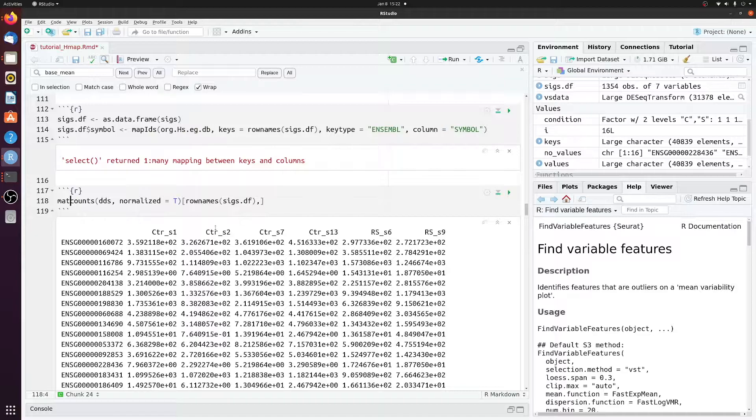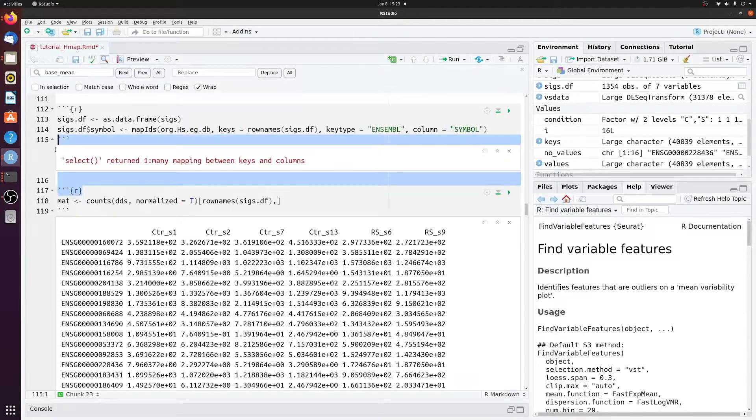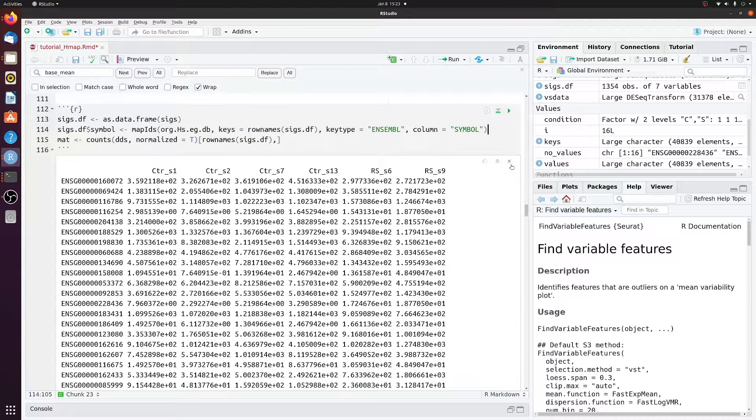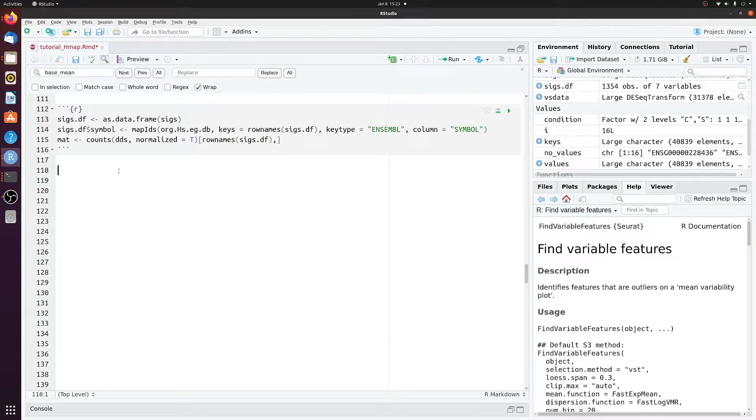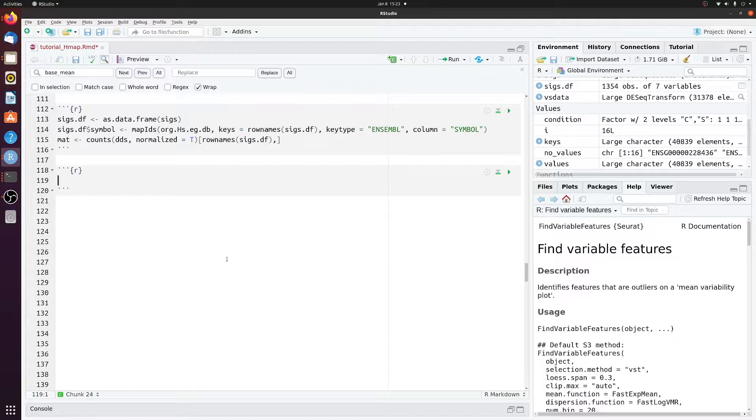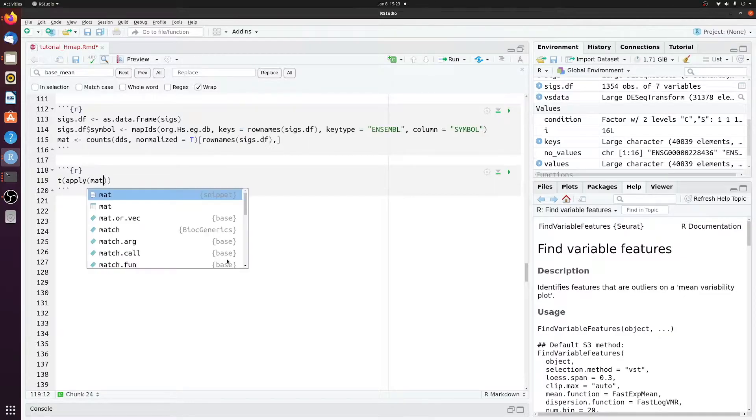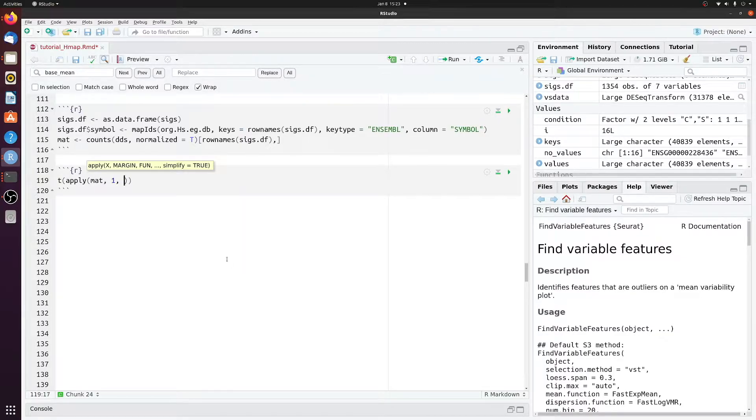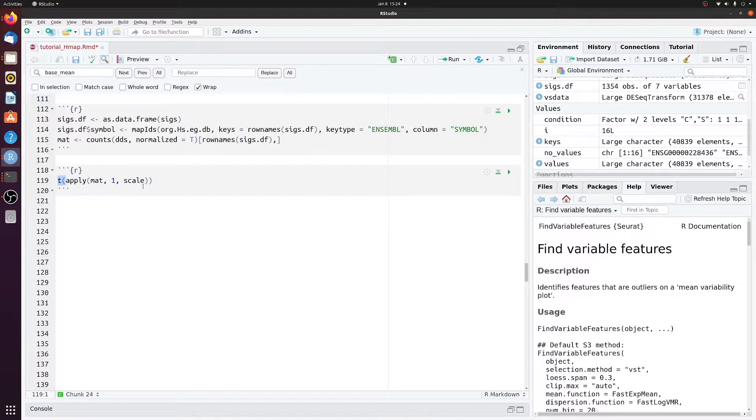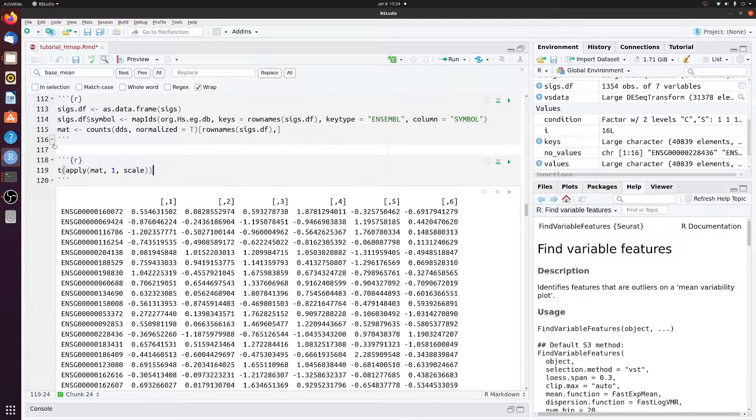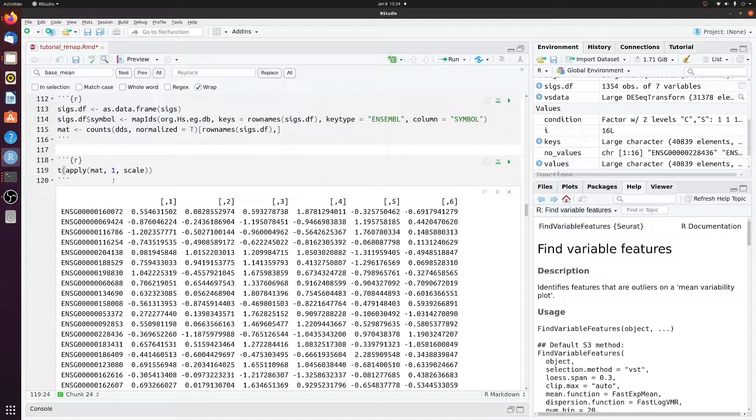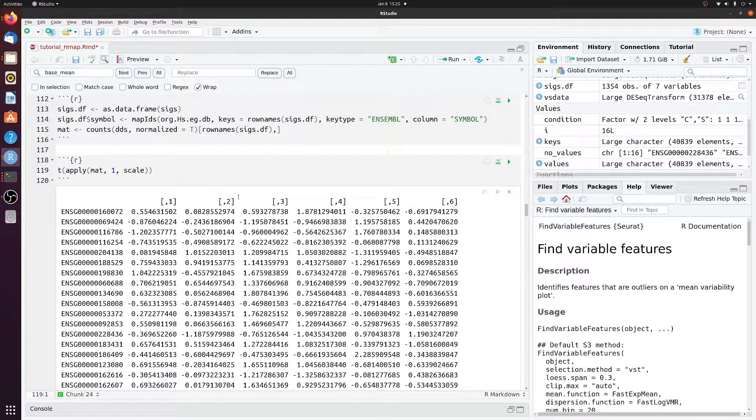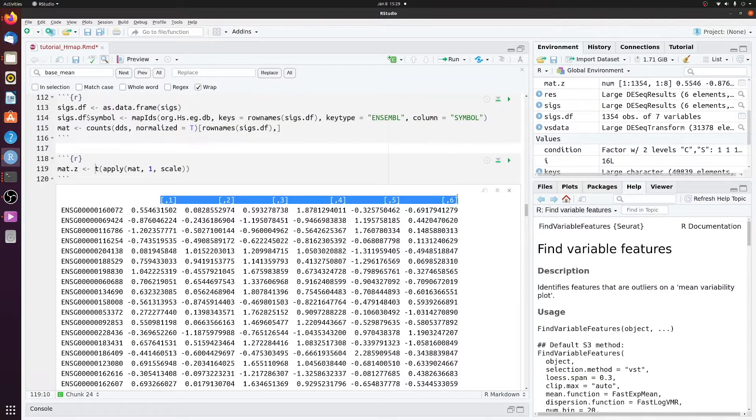And let's just call this mat for short. And next we want to get the z-score for each row. This is going to be a transpose, apply to the mat object we just made, 1. And then we're applying scale, which will return the z value. And then we had to transpose it because this would apply to the columns and return a funny shape. So now we have the same exact shape matrix as mat, but we have z-score values. So we'll just call this mat.z.